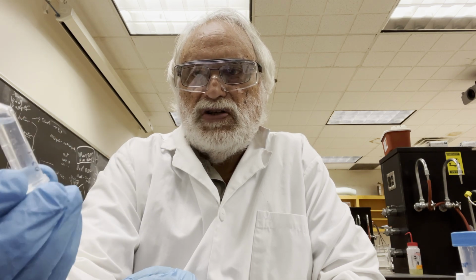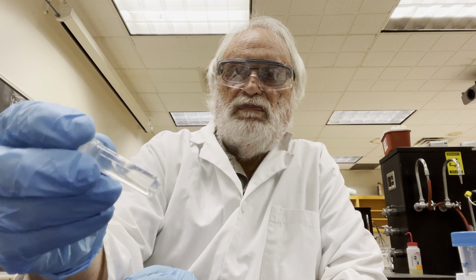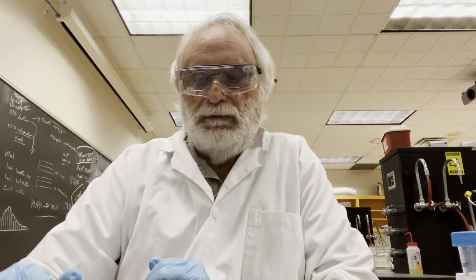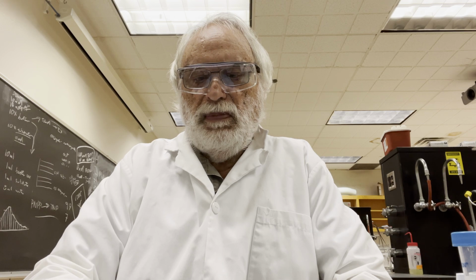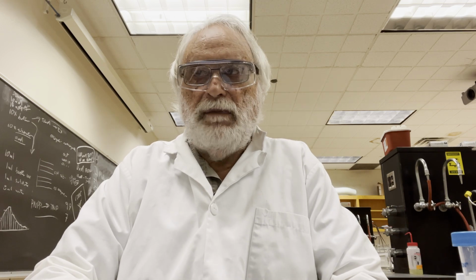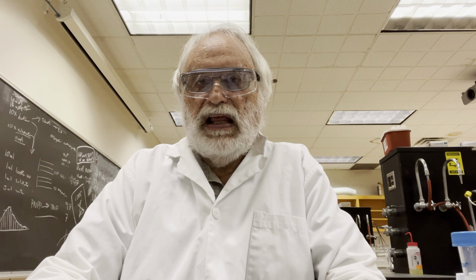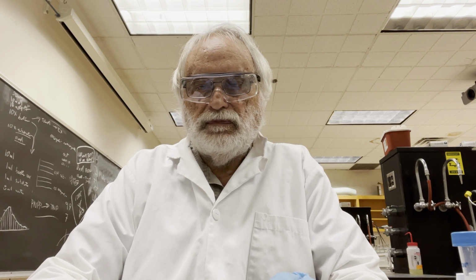So I'm now making sure it's mixed well. Notice I'm tilting it back and forth, making sure it's nicely mixed. So I'll set it off to the side here. Now we're going to lay it out on the plate, and I'd like to talk about what I think about when laying out an assay on a plate.